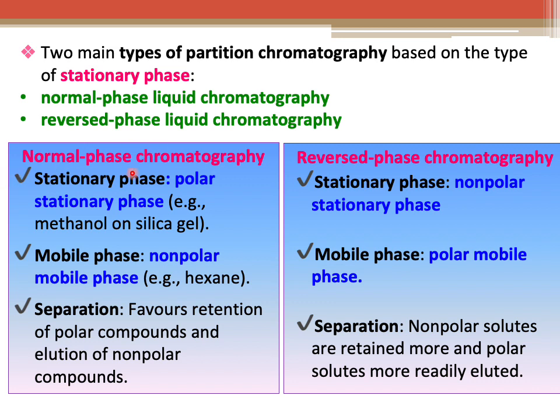Okay, so for normal phase chromatography, the stationary phase is polar. Sebab itulah dia mudah absorb, sebab satu jenis fasa tu adalah polar, satu lagi tak polar. So that's why dia boleh bergantung kepada the solubility. For example, methanol on silica gel. And for the mobile phase, it should be non-polar. Kalau stationary phase polar, mobile phase should be non-polar. Kalau normal phase, stationary phase mesti polar.